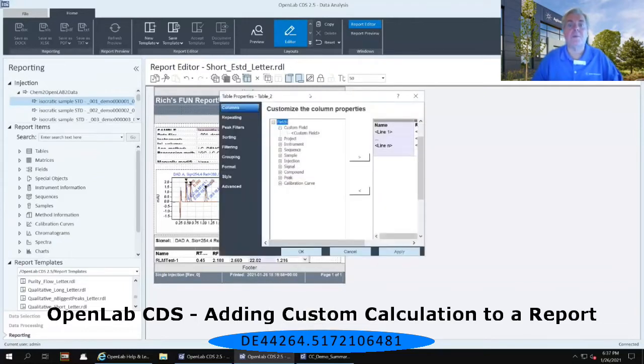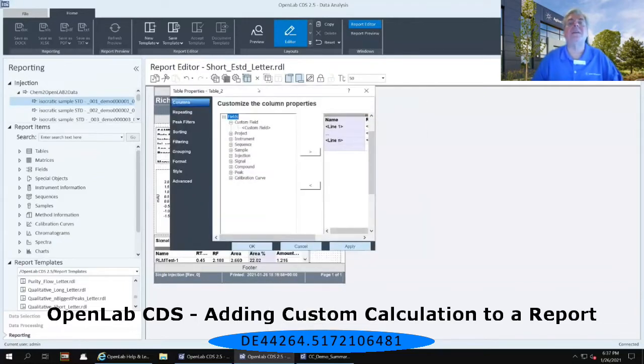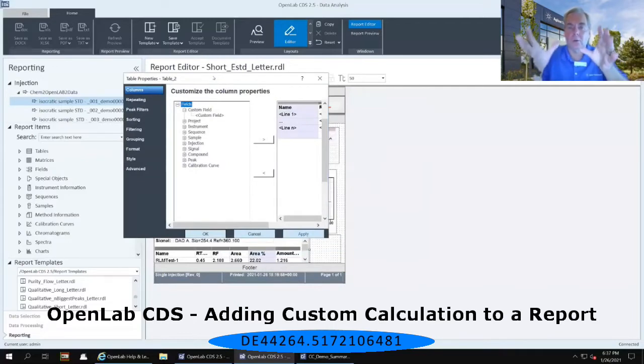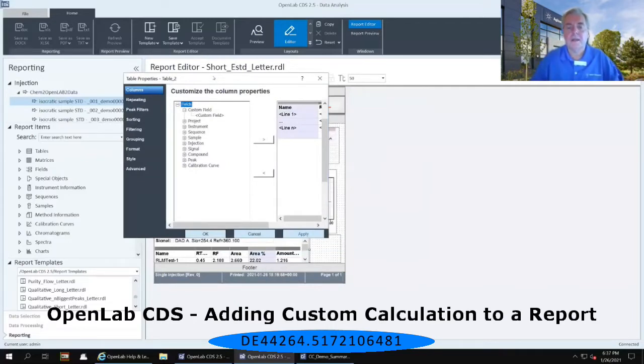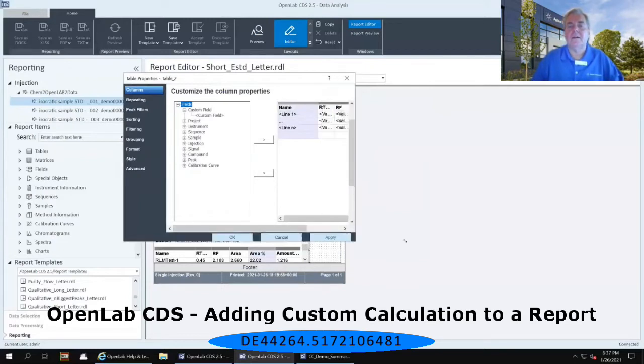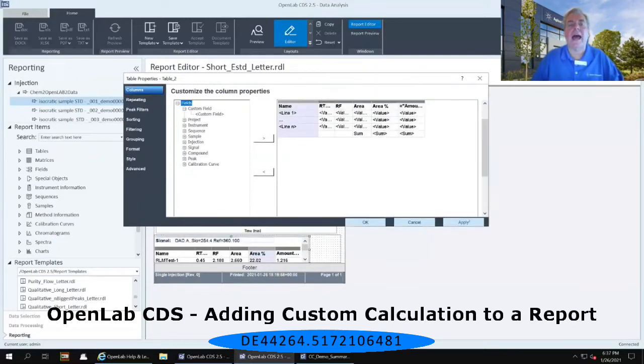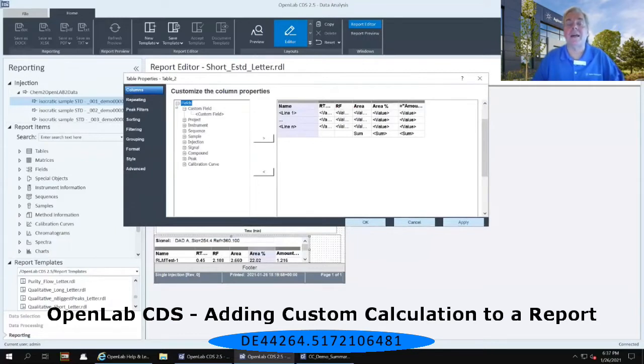This opens up the properties of the entire table, not of one single column. Now, from this properties area, I can then look at a variety of other options that I have available to incorporate into this table.